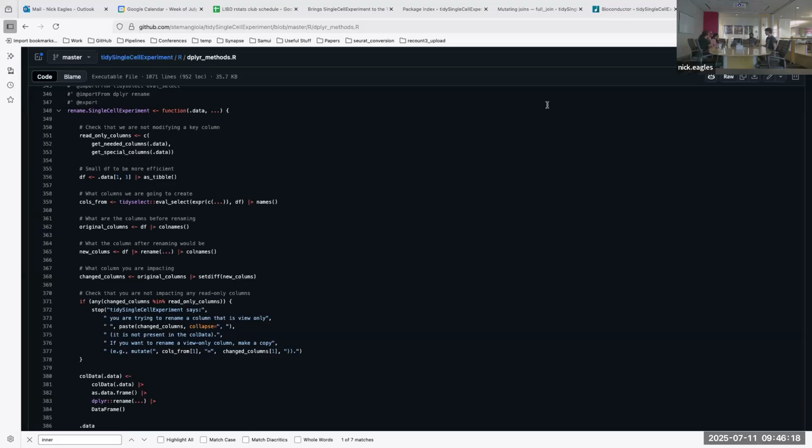Have you tried it with any of the HDF5-backed data? No. Yeah, I don't know, give it some of these things and it might just blow the memory up, or maybe not as much. It's mostly for the assays, right? At that point, yeah, because it seems like you have to explicitly join in the genes, which then joins in the counts as well for the assays. And if not, it doesn't load it, maybe.